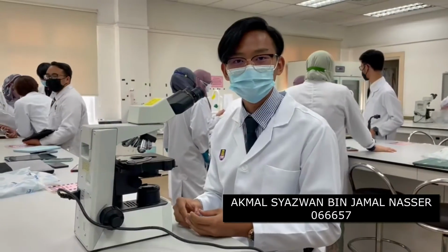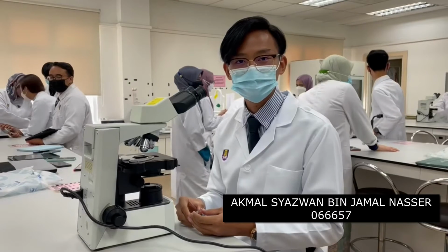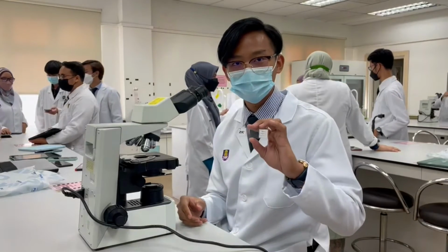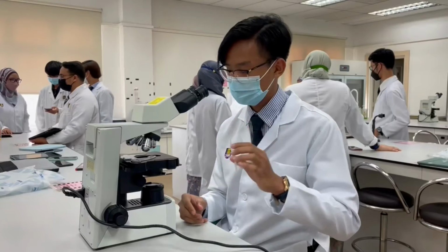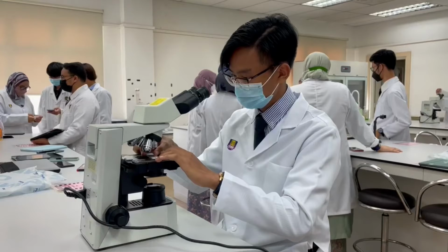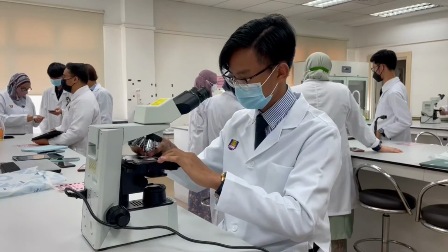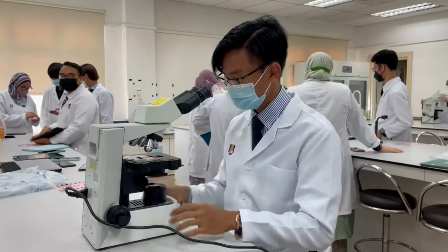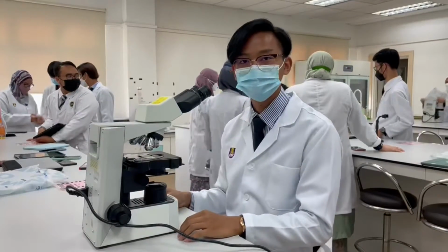The next step is we will place the slide containing the specimen on the stage and clip it with a stage clip. We need to note that every microscope comes with one or more clips that can be used to hold slides. We should never try to use DIY clips since they are not stable, and the stage clips are designed to hold the delicate glass slide without causing damage and causing the slide to move.